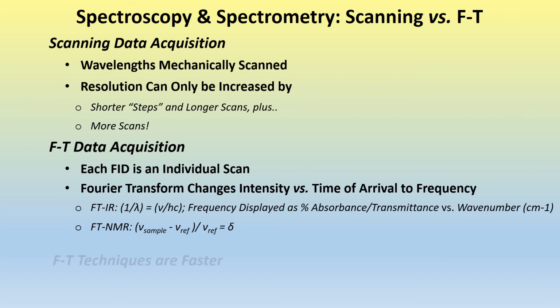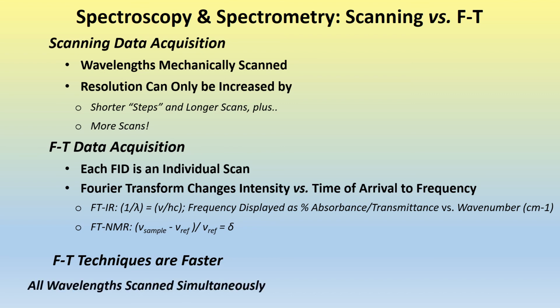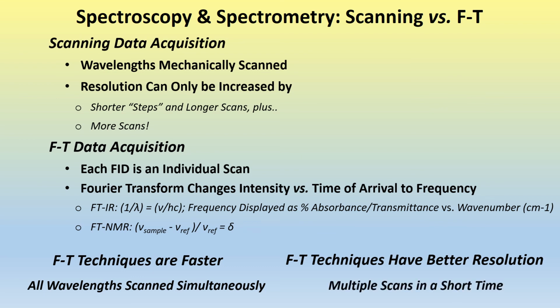Therefore, FT techniques are faster because all wavelengths are scanned simultaneously. They also have generally better resolution because multiple scans can be produced in a short amount of time.